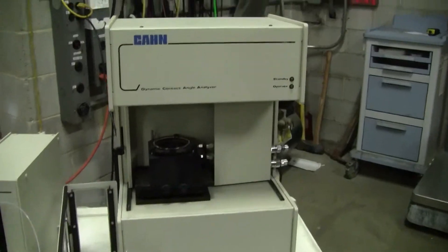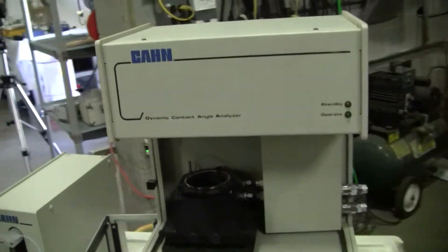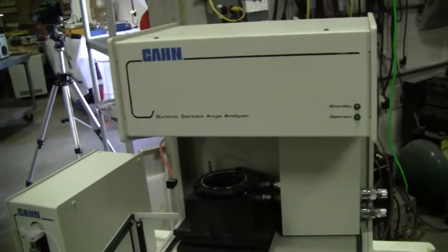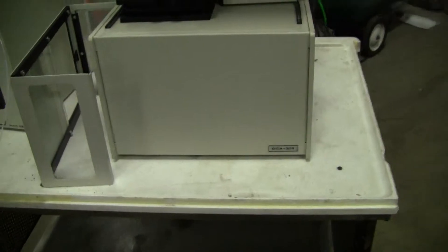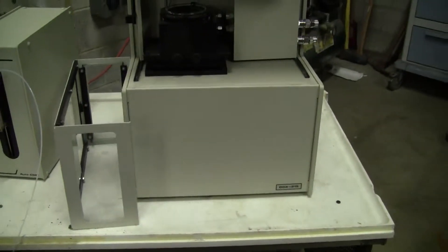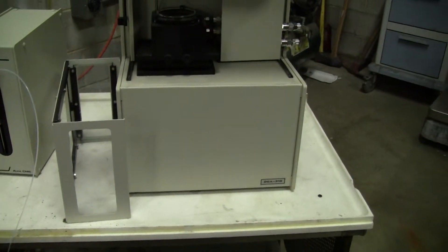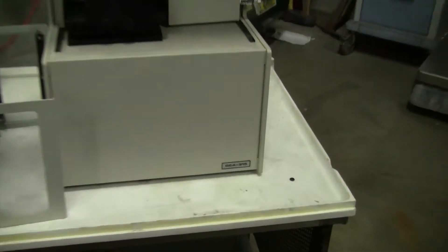Hi, this is Michael Natow from HitechTrader. Today we're looking at a Kahn dynamic contact analyzer. This is an incomplete unit because it does not have a computer or software.